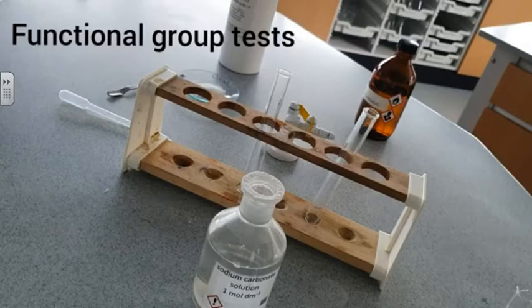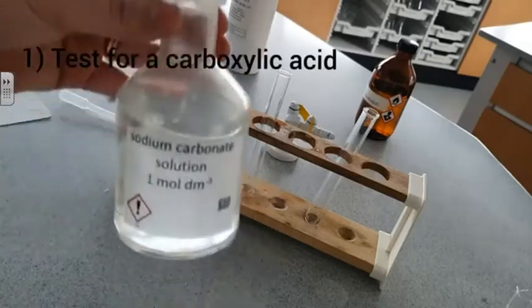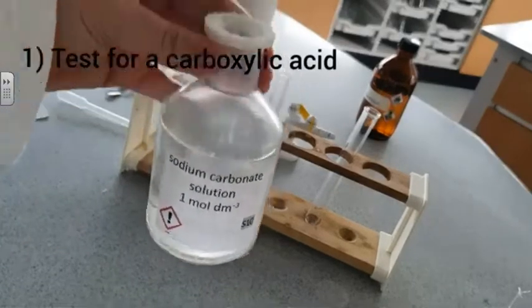In this video we are going to look at some functional group tests for organic functional groups. The first functional group test we're going to look at is the test for a carboxylic acid.